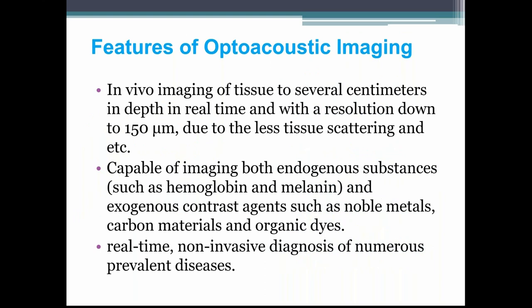And optoacoustic imaging has many beneficial features in terms of practical applications. For example, in vivo imaging of tissue to several centimeters in depth in real time and with a resolution down to 150 micrometers can be achieved as a result of the less tissue scattering. And it's capable of imaging both endogenous substances such as hemoglobin and melanin, as well as exogenous agents such as noble metals, carbon materials, and organic dyes. And what's more important is that it holds great potential for real-time non-invasive diagnosis of numerous diseases.